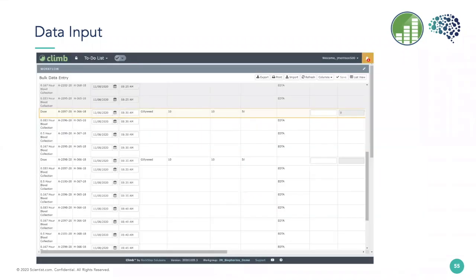So we've designed the study, we've scheduled everything in just the right way, we've staggered all of our doses here by 5 minutes, we have enough staff on hand to accommodate for overlapping time points.